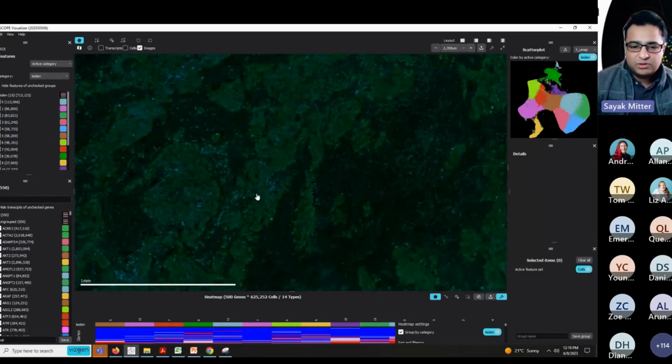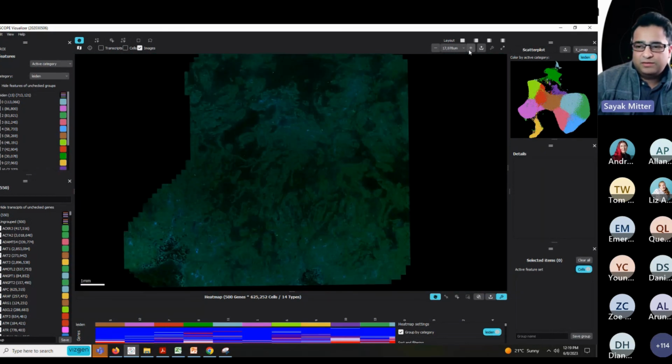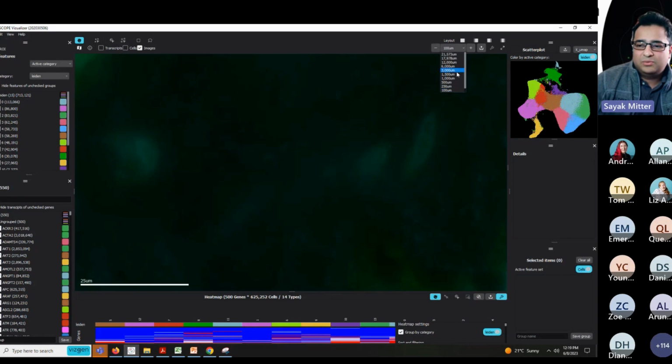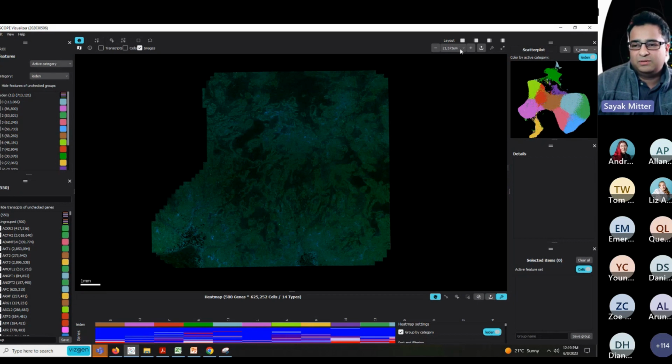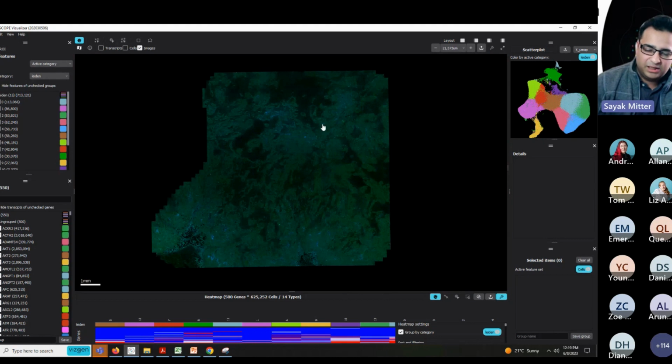However, there are two other options to zoom into this. So I'm going to quickly show those two options. The first one is to use the little window here, the buttons here. If you hit subtract, you can zoom out, and plus you zoom in. Furthermore, there's a drop-down menu if you really want to quickly zoom in or out, for example 100 microns, or if you want to go out, you are able to quickly select different zoom factors to look at your tissue sample.